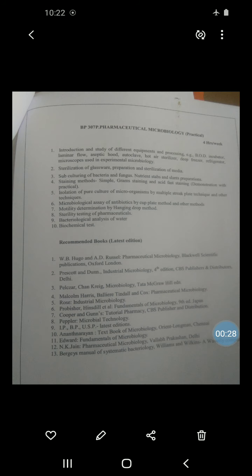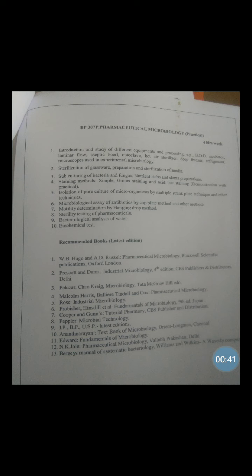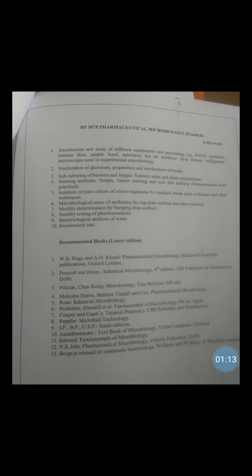The requirements for this practical are: first, cultures — we need three cultures: E. coli, Bacillus cereus, and Staphylococcus aureus. The stains required are crystal violet and safranin. The reagents required are 95% ethyl alcohol and Gram's iodine.